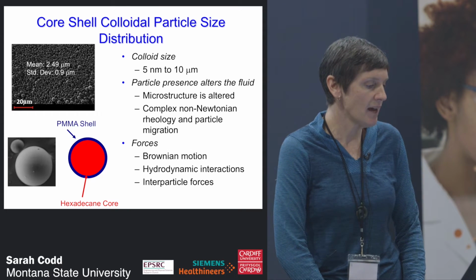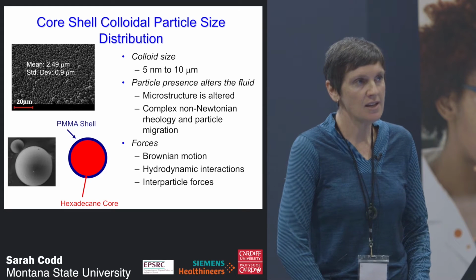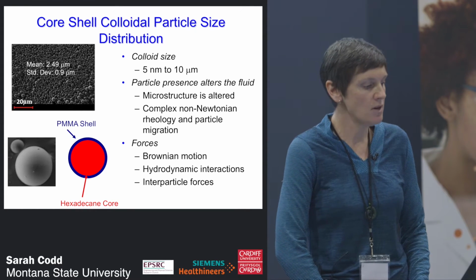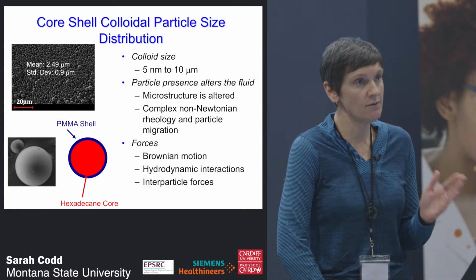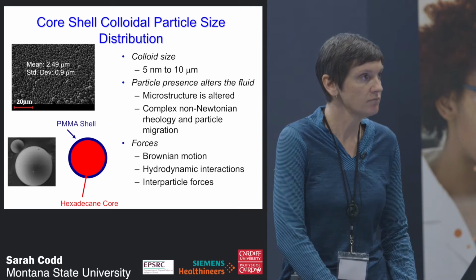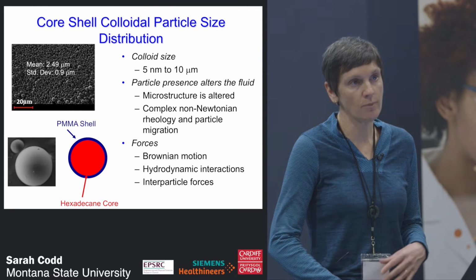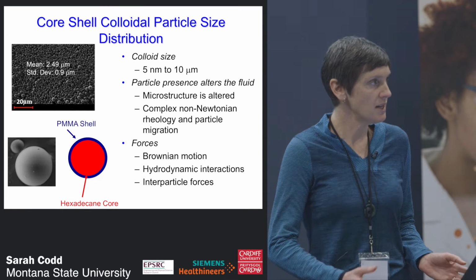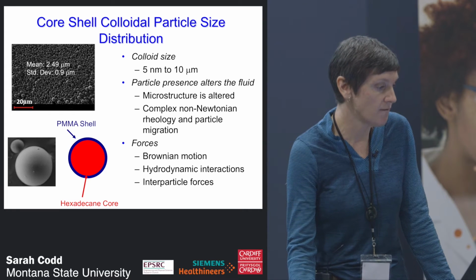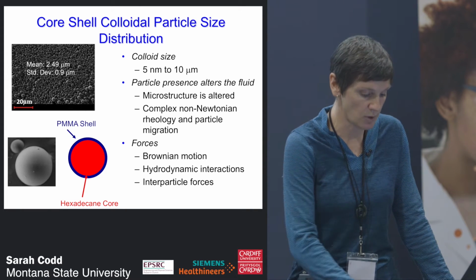The idea about these particles is that you can get a hard PMMA shell, and inside them you can have one fluid that has a different NMR spectrum, a different NMR frequency, from the surrounding fluid. In this particular case, it was an oil center and water as the solvent. And so we could spectrally resolve and look at both the colloidal particle transport as well as the transport of the solvent around it.